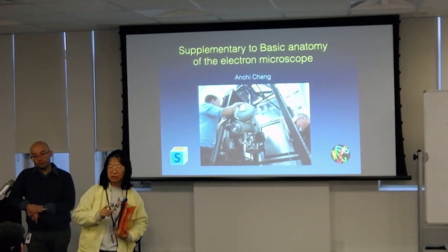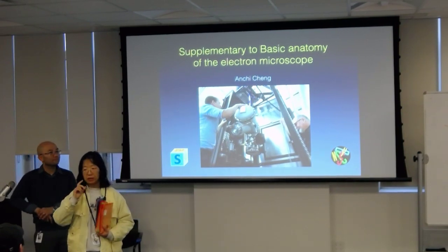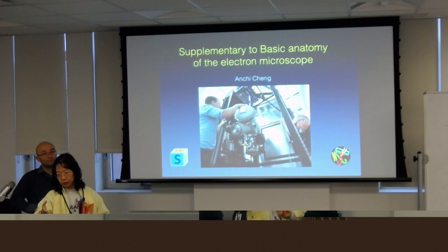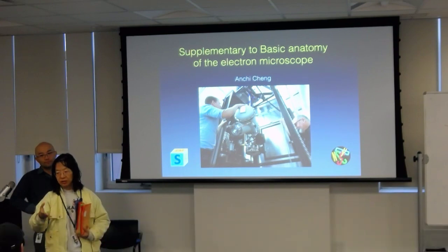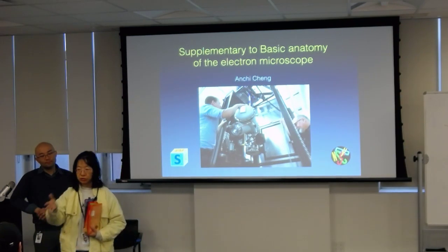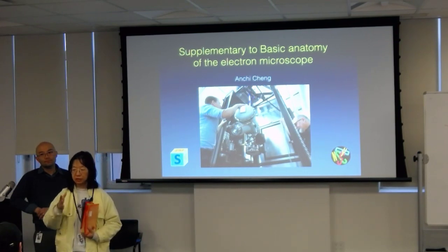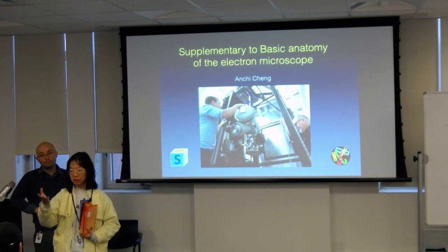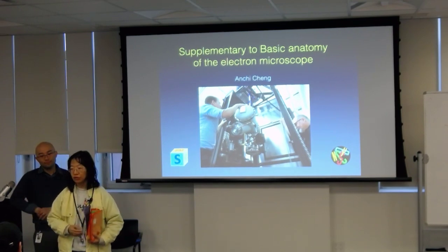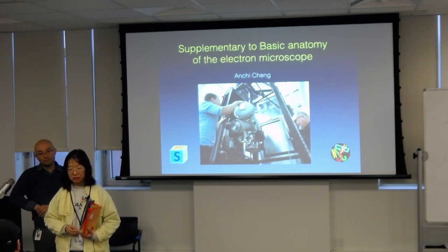Now, there's one thing that you should understand, which is that each microscope that you look at can do multiple high tensions. So the value that we just quoted is the highest value that it will take. You can do it at the lower value as well, but a lot of the time it's going to require a new alignment to make everything perfect for it. So that's the difference between them.